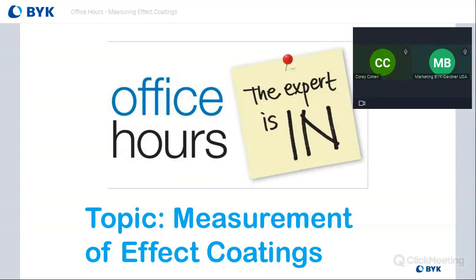And what it's telling you is that maybe the surface is hotter than it should be during measurement, and that's to prevent measurement of what could potentially be thermochromic surfaces where the actual color might change due to a change in temperature. Particularly yellows, oranges, reds tend to be more susceptible to this, where the color can change a bit depending on changing temperature. And so there's a typical range you want to stay within when measuring those surfaces. So that's what that warning is. It's actually a software feature.